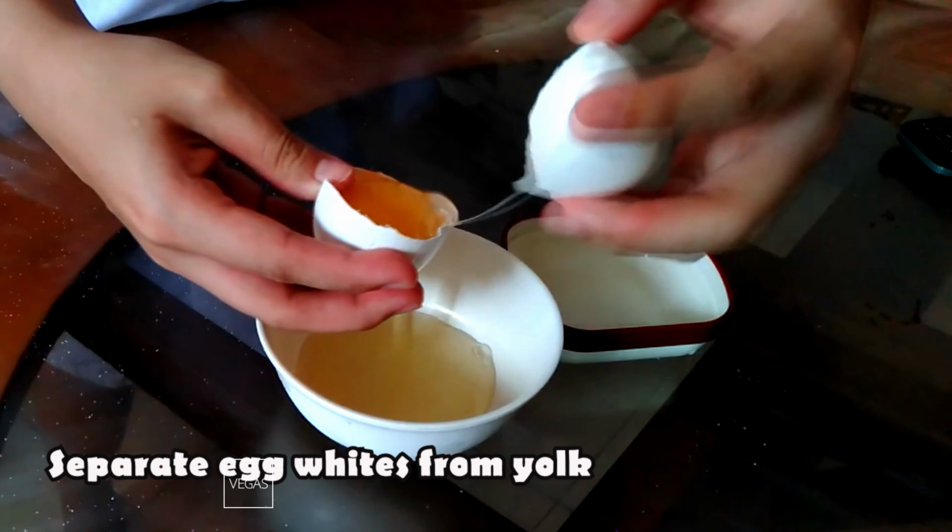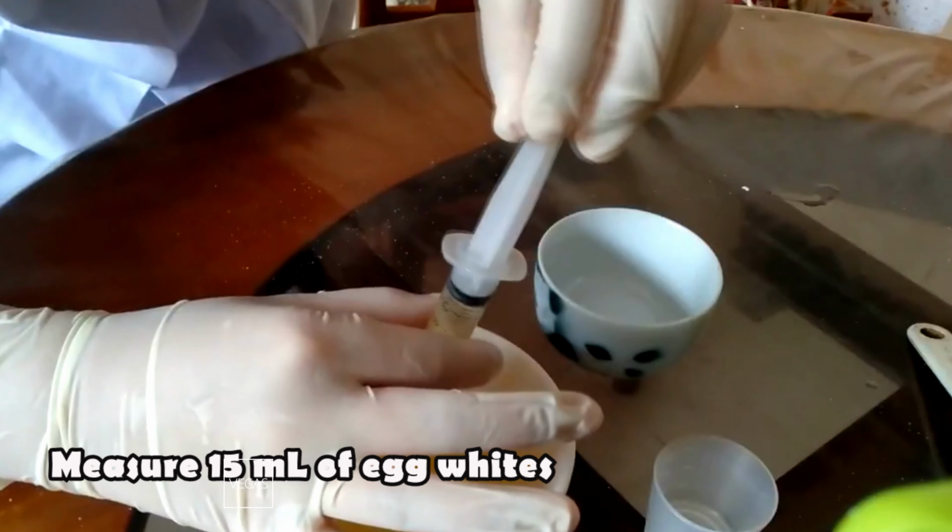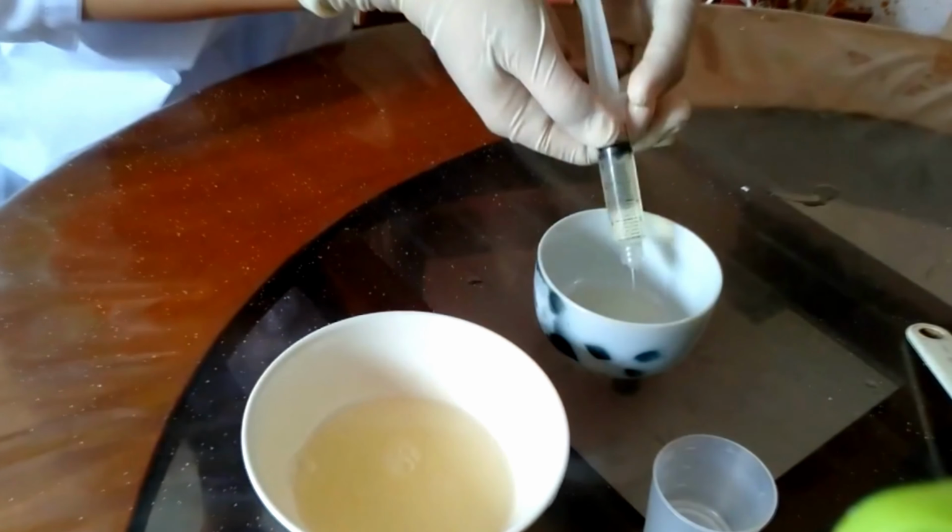First and foremost, separate the egg whites from the yolk. Measure 15 ml of egg whites. We'll be using this for all the experiments.